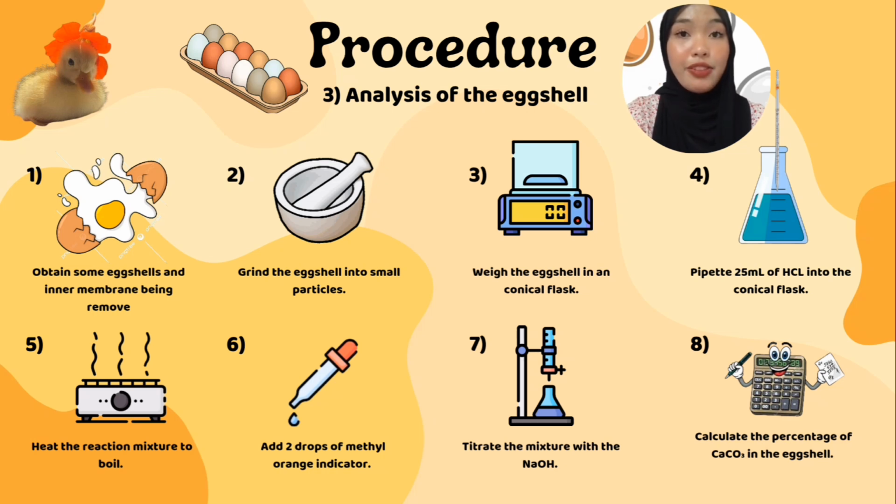After that, heat the reaction mixture to boil. Cool it down and add 2 drops of methyl orange indicator. Then, titrate the mixture with sodium hydroxide until the color changes to yellow. Repeat steps 2 to 5 and calculate the percentage of calcium carbonate in the eggshell.